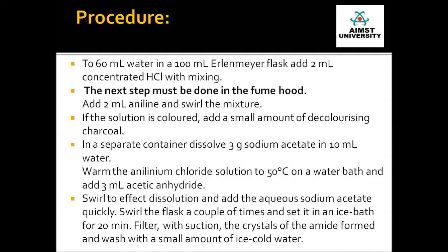Filter with suction the crystals of amide formed and wash with a small amount of ice cold water. Continue to apply suction to the Buchner funnel for a few minutes. Dry the material between filter papers and submit your sample for assessment. Determine the yield and melting point of your product.